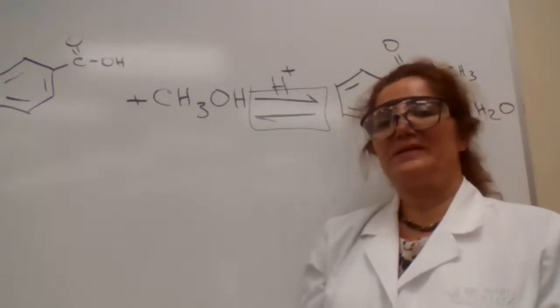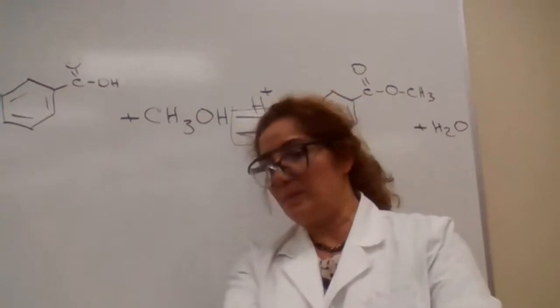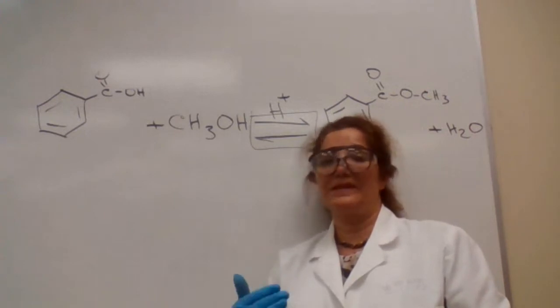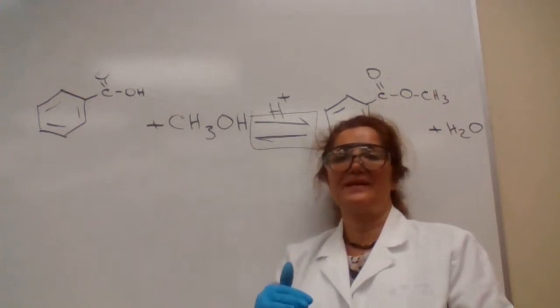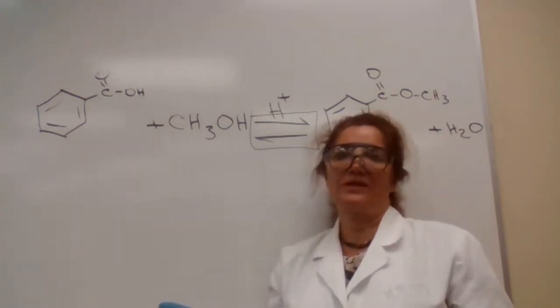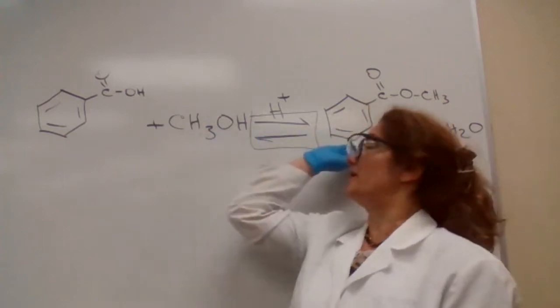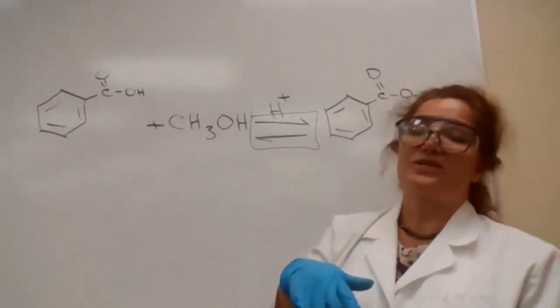Based on colligative properties, you can actually calculate the number of moles, but that's not the purpose of the experiment today, and we are not going to do that. So the boiling point of the solvent is 65 degrees Celsius. The boiling is going to happen at that temperature and will maintain that temperature until the reaction is complete, because you have attached a condenser. So it's impossible to provide 100 degrees Celsius to remove water for this reaction.